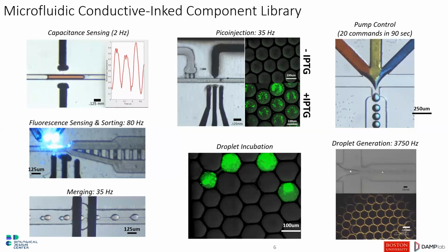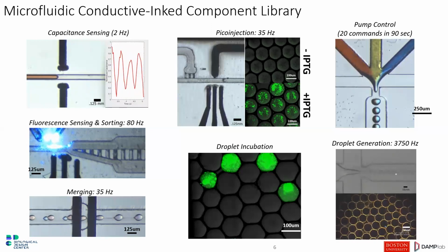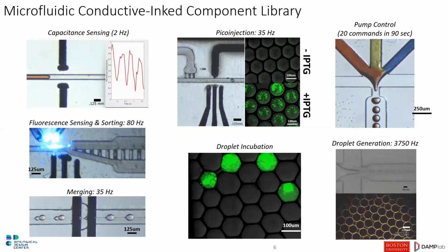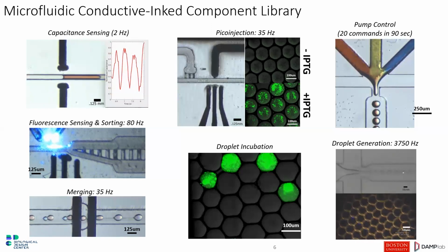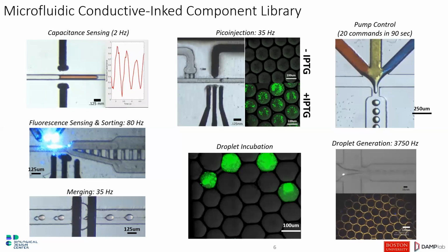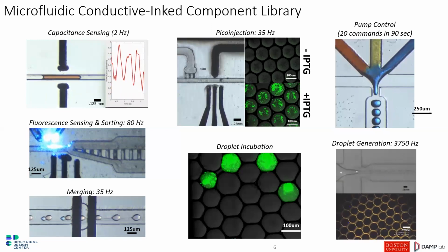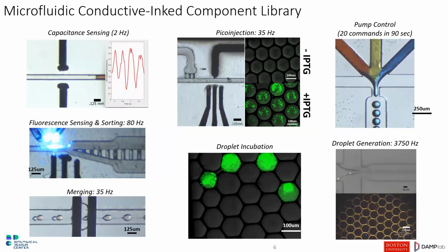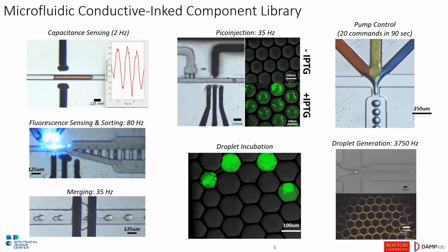So like I said here, you can think of all different ways of merging different concentrations of different liquids and things like that, and then having those droplets being generated as we show here, but with the single cell encapsulation capability, if you want. And then, of course, why do we need a droplet in any case, right? What we're trying to do here is make tons of those droplets, each one representing one experiment that you can run. Like thinking about different wells in a 96 or 384 well plate. Now we're talking about thousands and thousands of independent experiments that you can have in the droplet, right? And then you can just keep generating them and experimenting on them after cultivating them.